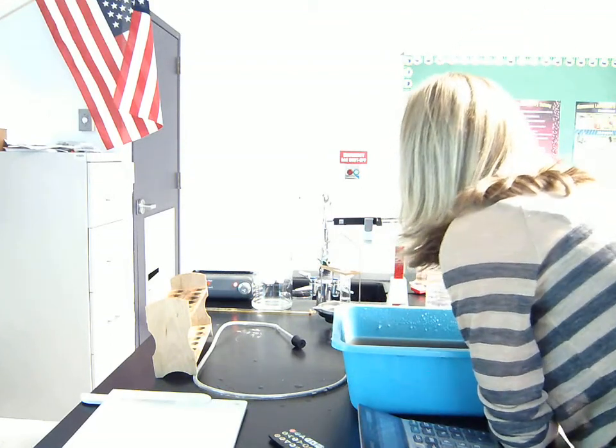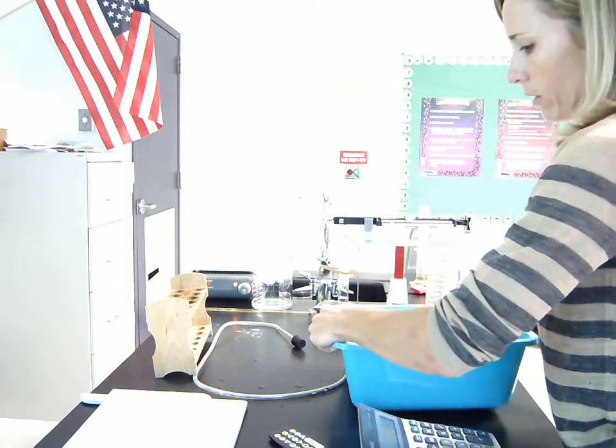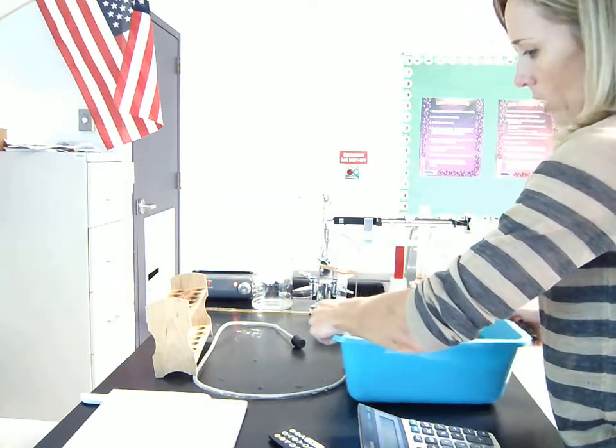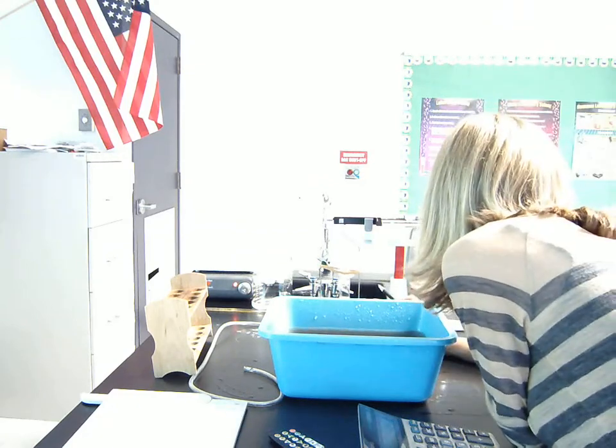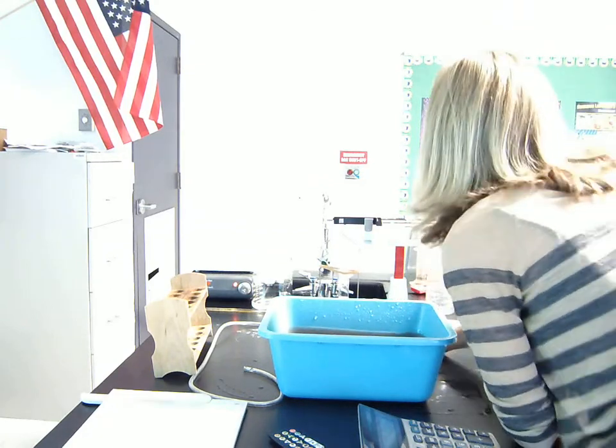Oh, for heaven's sakes, I just touched the balance. That's annoying. Let's let it settle down. Okay.